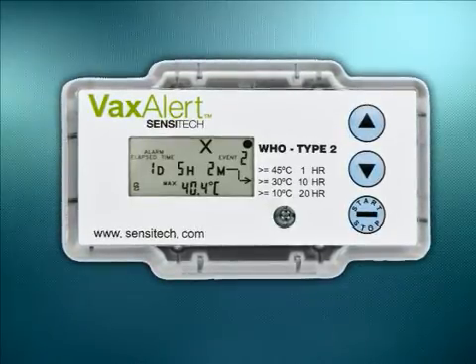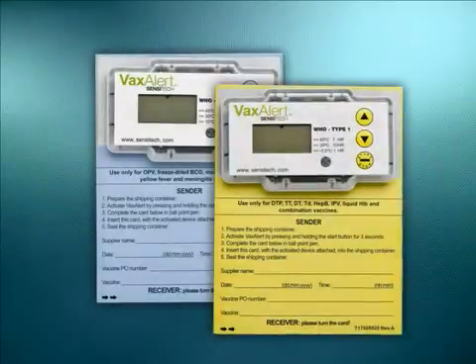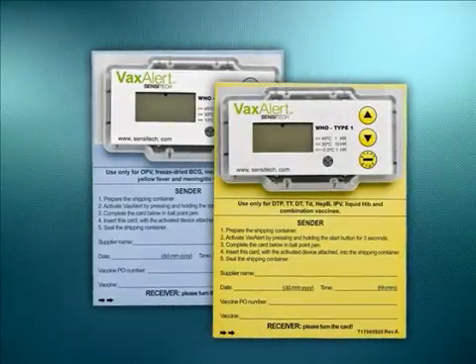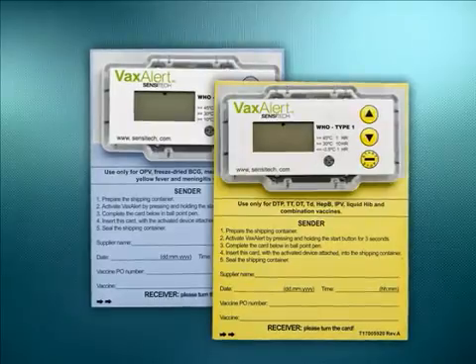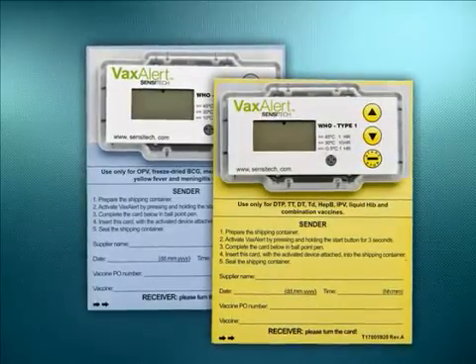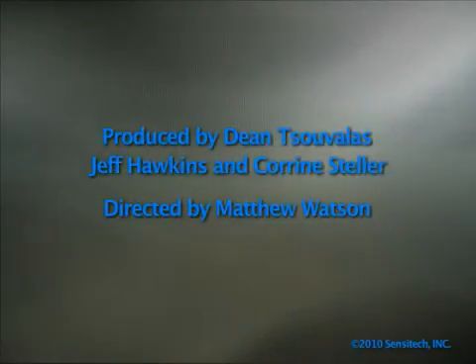The Vaxalert will monitor set time temperature alarm conditions and retain alarm violation history information until the battery is depleted. Before the battery becomes exhausted, the device will display a low battery signal at the bottom left corner of the screen, indicating that the proper function of the device can no longer be assured. When operated and evaluated according to these instructions, the Vaxalert electronic shipping indicator provides reliable shipment information and assures compliance with the WHO guidelines on the international packaging and shipping of vaccines.